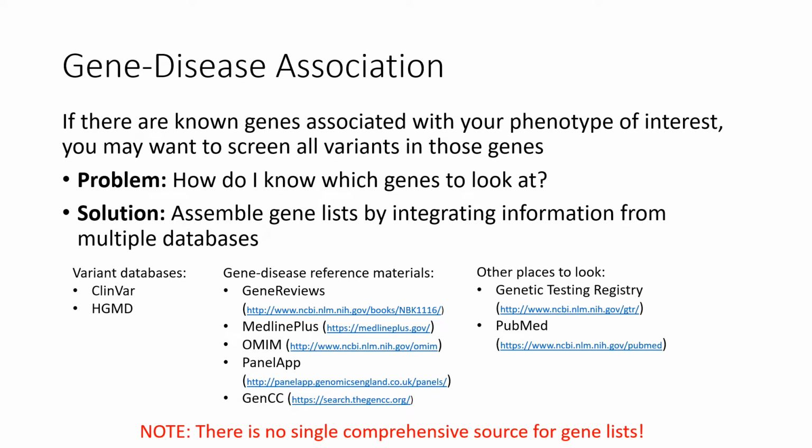perfectly up to date. Panel App is a service, kind of a crowdsourcing approach to developing gene lists that has been developed by Genomics England. And actually, it's a really nice new feature that we have in seqr that we have imported all Panel App gene lists into seqr automatically. So anything that's available from Panel App can be used within seqr already.